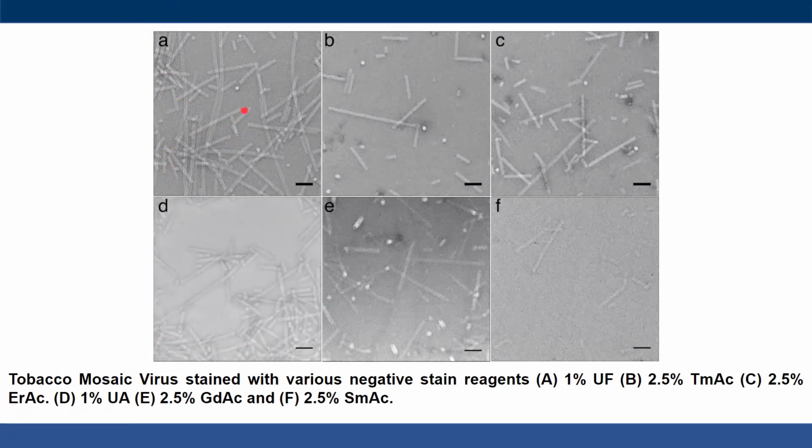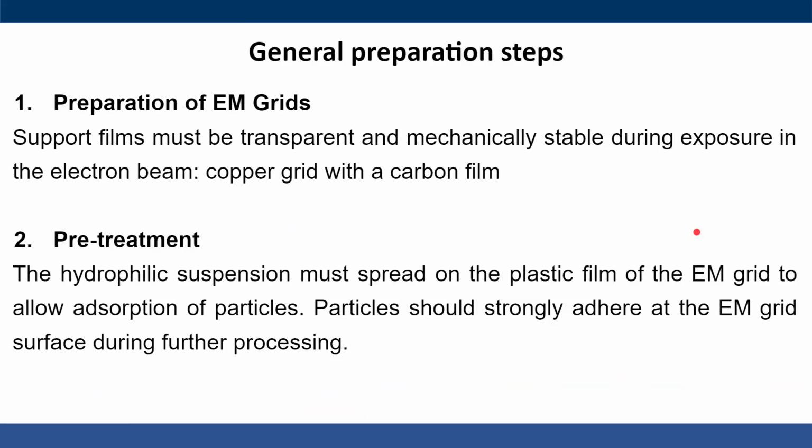It's very good, but when we compare to F, for example, everything's shady. We cannot tell exactly the difference between the background and the virus. So we need to know what type of material, as I said, we are trying to study and learn. About the preparation steps, usually they are the same.